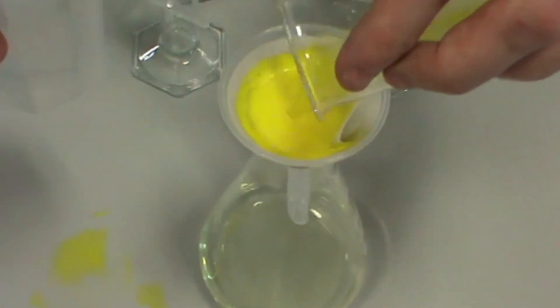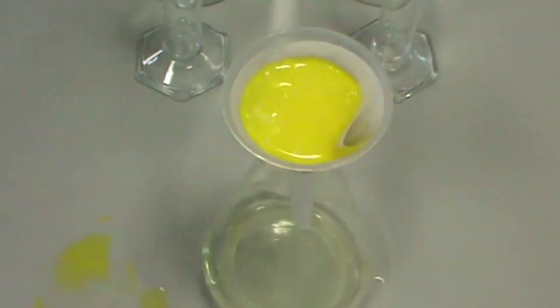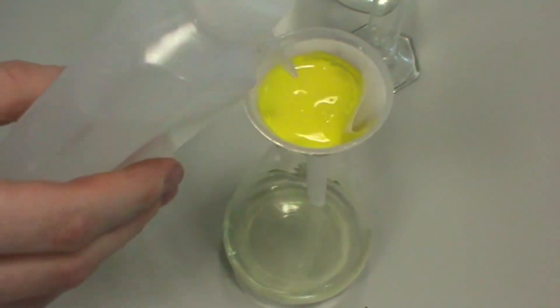To ensure you get the maximum amount of lead iodide, rinse the beaker with distilled water and pour the washings into the filter funnel. To ensure that all of your lead iodide is pure, wash the residue with distilled water and leave to filter.